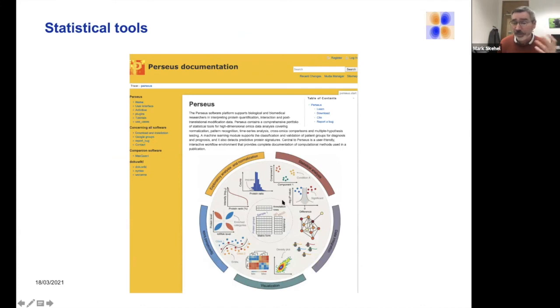I've just shown you scatter plots and volcano plots, but it does some principal component things. You can check out the distribution of your peptides to work out whether it's a normalized, Gaussian distribution, and then you can work out whether actually the experiments worked or not, and it gives you heat map kind of things. Also, it's a really nice tool. Some people do this kind of stuff in R, but it's available to you.